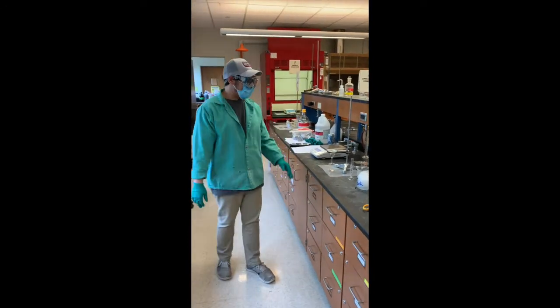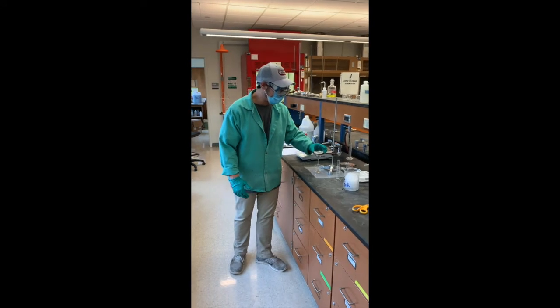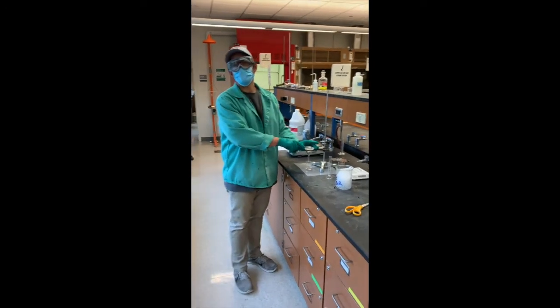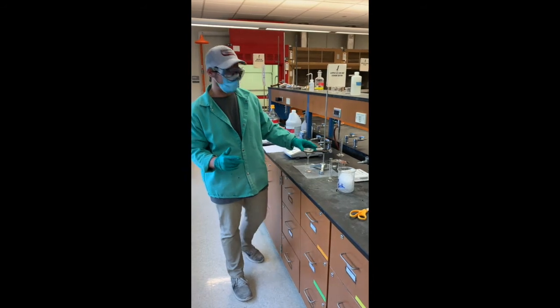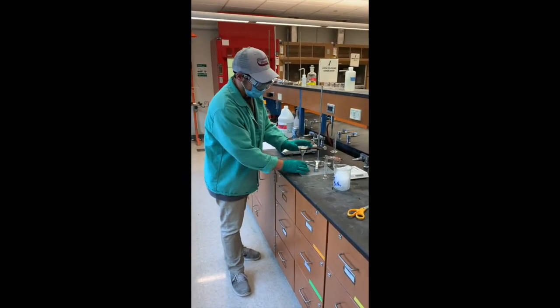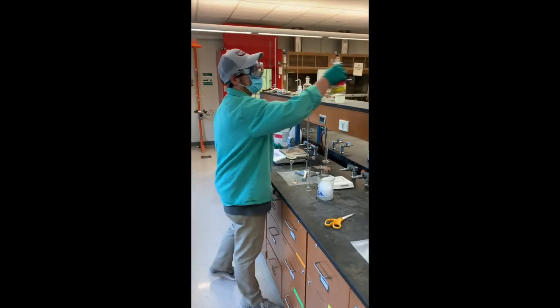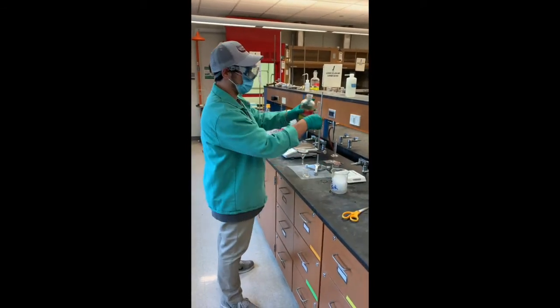So we're finishing up the first part of step 5 where we have filtered off any impurity. You're going to dispose of this in the front hood or in the designated waste beaker that your instructor tells you to. So we're going to get rid of that. And to our filtrate, we're going to add 8 milliliters of 9 molar sulfuric acid.